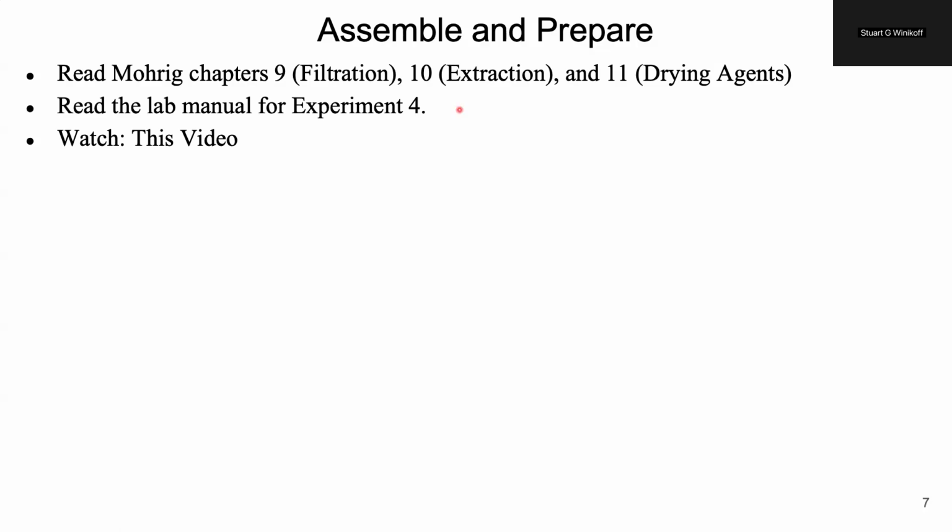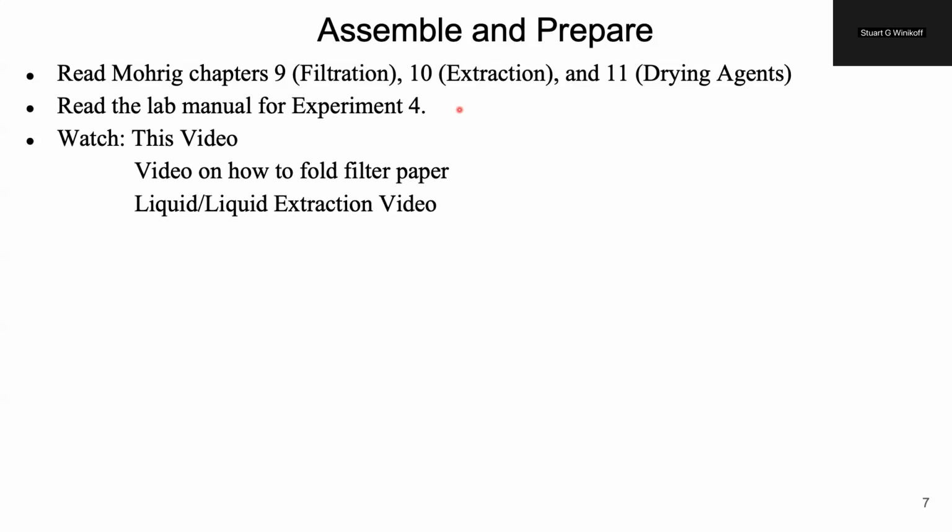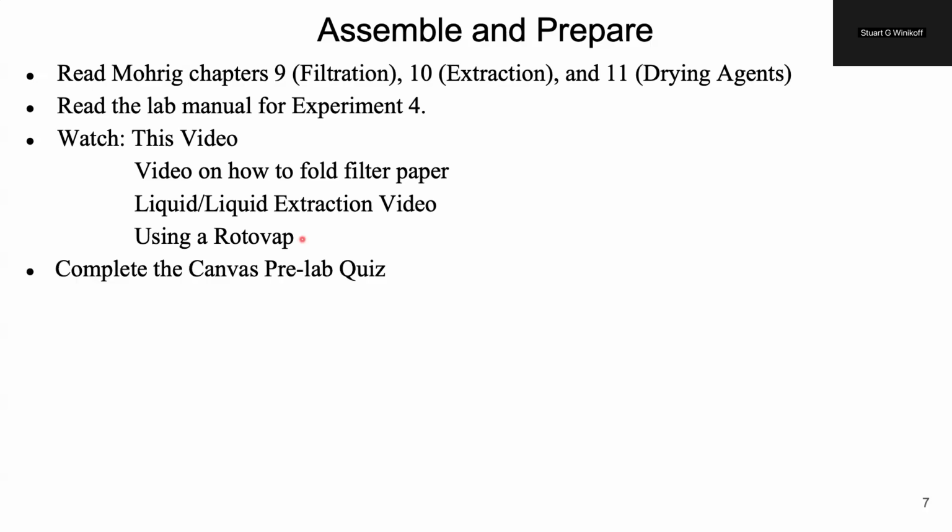Now, each of those steps of the procedure that I walk through has a separate video for it. So there is a video on Canvas of how to fold your own filter paper, another video on how to use a separatory funnel to perform a liquid-liquid extraction, and a third video on how to use the rotovap. I'll probably mostly be using the rotovap due to time constraints, but it's good to have a background of what a rotovap is and how it works.